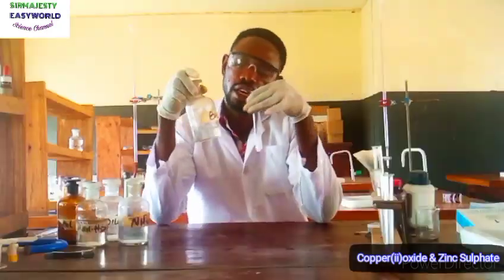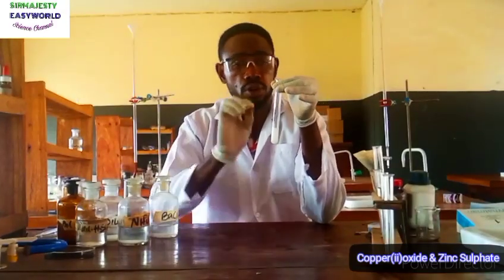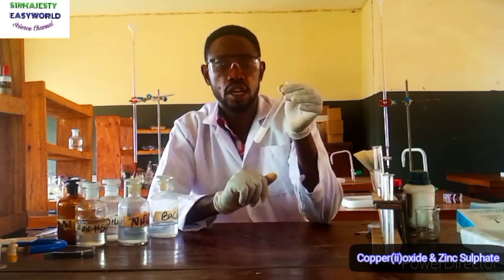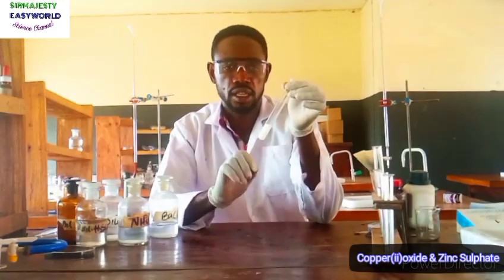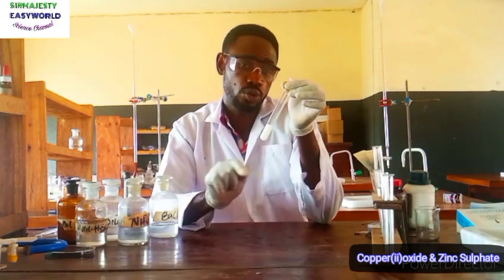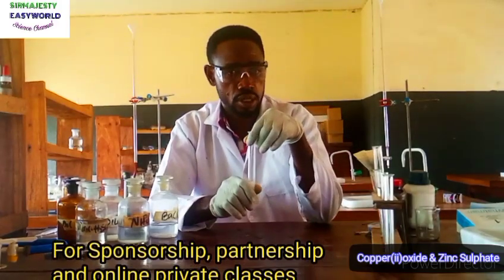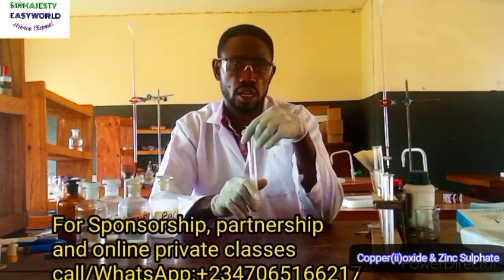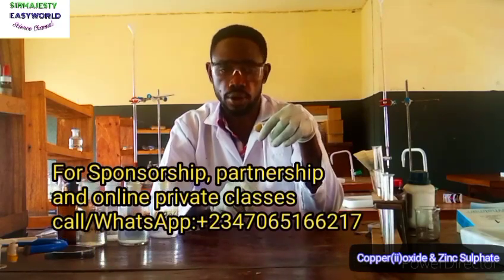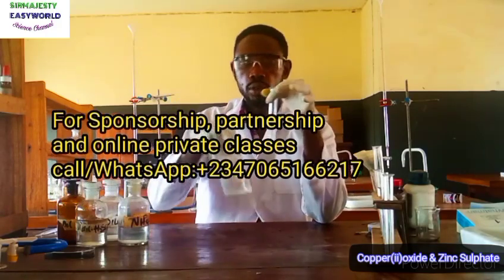Then in chemistry, anytime you add barium chloride to a solution of an unknown sample and it forms a white powdery precipitate like this, you suspect three anions, which are SO4^2-, SO3^2-, or CO3^2-. That is tetraoxosulphate(VI) ion, or trioxosulphate(IV) ion, or trioxocarbonate(IV) ion. The reason is this is a kind of double decomposition.